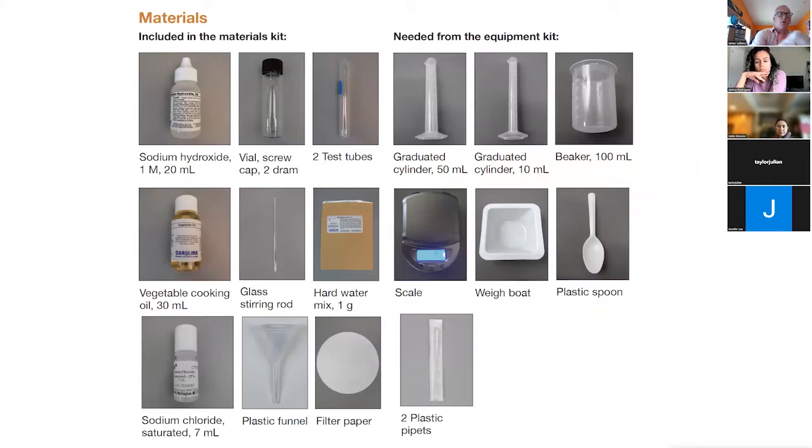We're going to need the 1 molar sodium hydroxide. I think it either comes in this kit or in this particular bag. It comes with some vegetable oil.